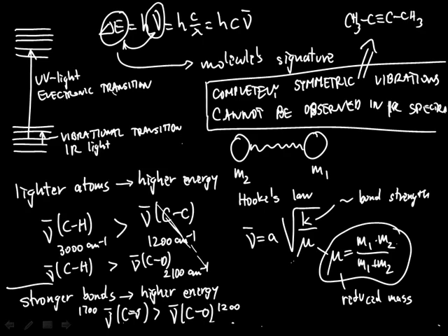So that's something that you always need to be mindful of, even if you have a certain functional group, but it's substituted in a completely symmetrical fashion. It will either be weakened or it can completely disappear from your spectrum.